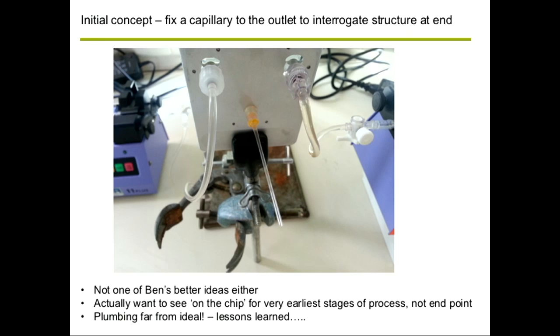Yeah. So ideally what we wanted to do is follow these processes of transformations between particles using the mixing element and then having some sort of aging of the sample as we go down here. The problem is, this would in theory work, but we're only sampling from a time point that's a long time after the initial mixing stage.